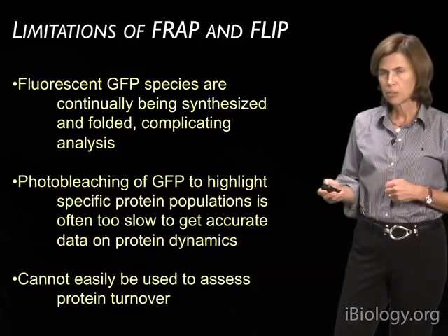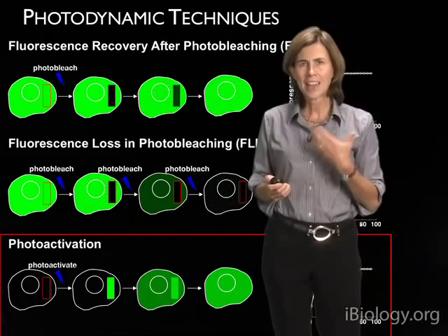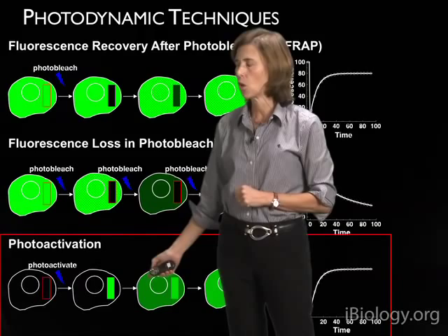And so that's led researchers to look for an alternative photodynamic technique that would allow one to address these issues. And that's possible using photoactivation. In this technique, a photoactivatable fluorescent protein or dye is expressed within cells and is selectively switched on by photoactivation.